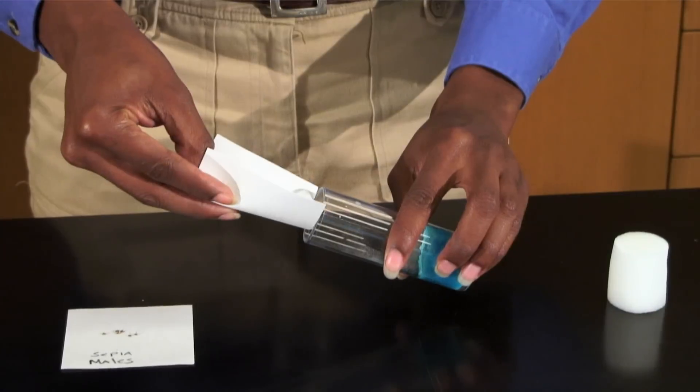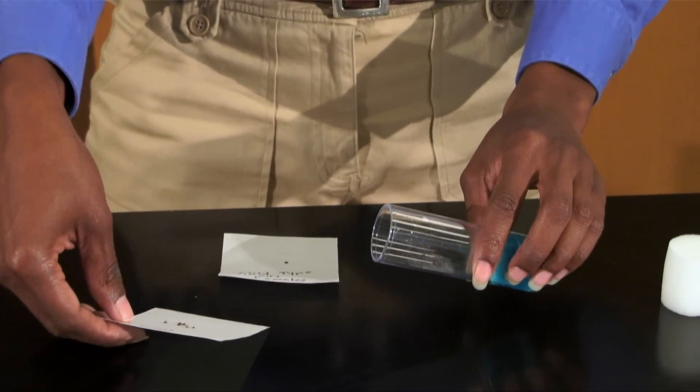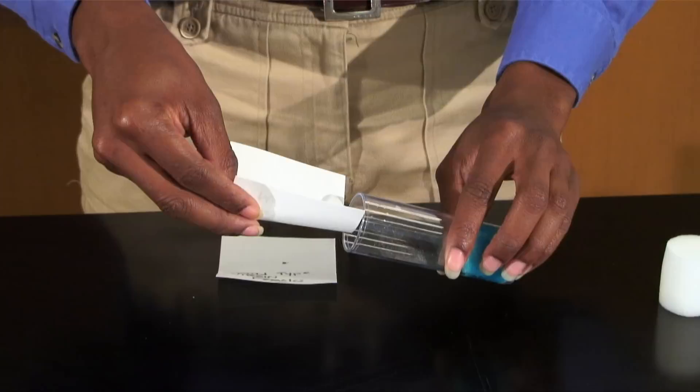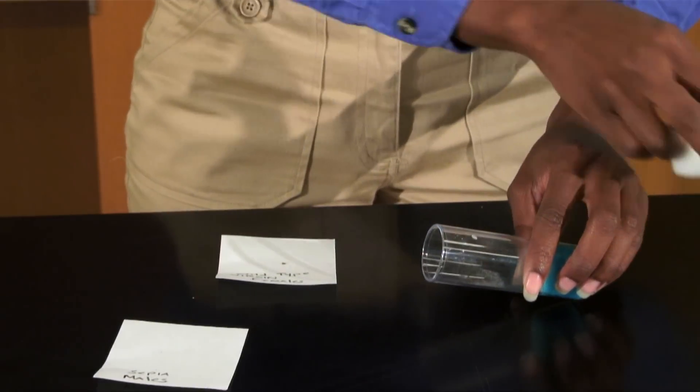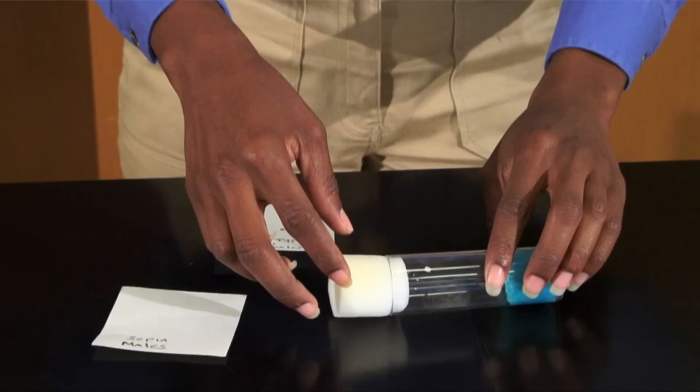Allow them to mate for three to five days, then remove them from the culture. Once the new adults emerge, you can accumulate data on the genotypic and phenotypic ratios. Also, they may be used to produce another generation.